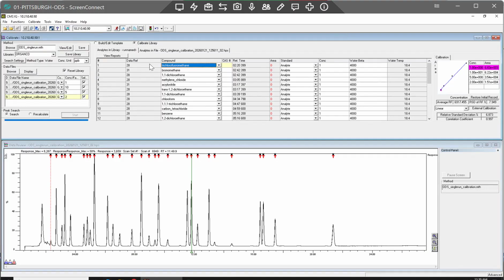Okay, so if I click these, it does change. I wasn't sure. It didn't look like it changed. So you can see your curve here. That 5 ppb point, I'm sorry, is a little off center. It could have just been made a little off, you're using micro syringes, so you never know. But anyway, that's decent. So let's look at our standard deviation, 6.8. That's pretty good. And then your R squared is 0.997. Ideally you want 0.999, but 0.99 anything is great. So we'll go through each one and make sure we at least have a 0.99.